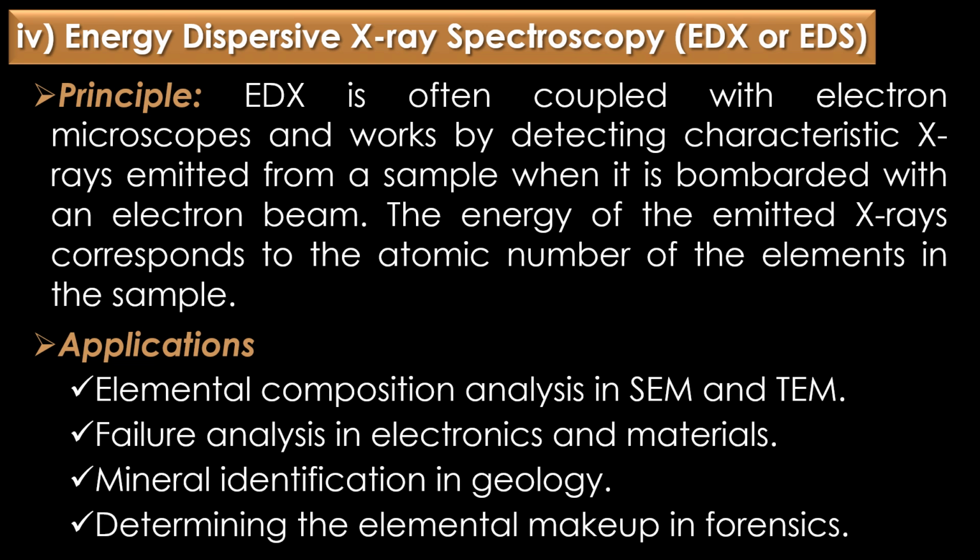The applications of EDX or EDS include elemental composition analysis in scanning electron microscopy and transmission electron microscopy, failure analysis in electronics and materials, mineral identification in geology and earth science, and determining the elemental makeups in forensics.